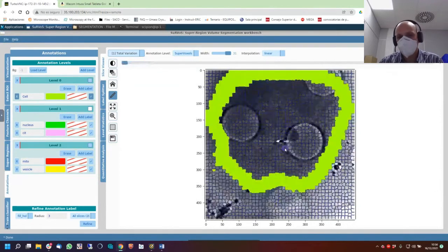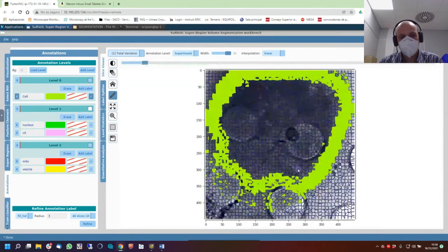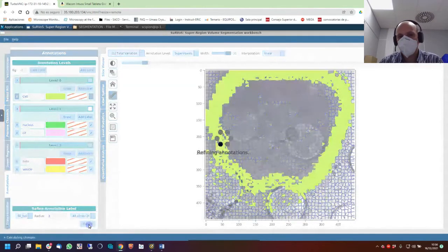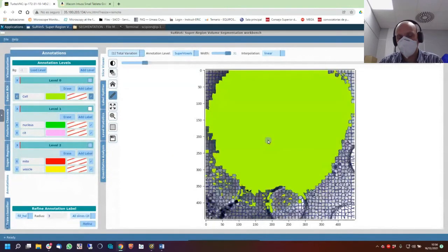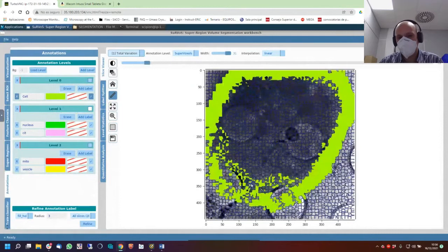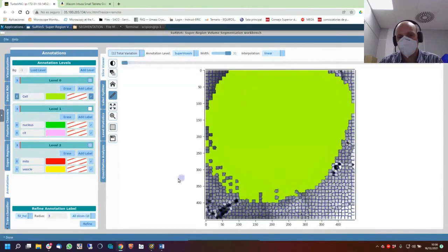So we have this, okay, and now with this, try again: fill holes, all slices in 2D, refine. And now, hey, there is something, you see, click. Why? Because it should be open here. And because it's open, it will not be like this. Fill holes, refine again.